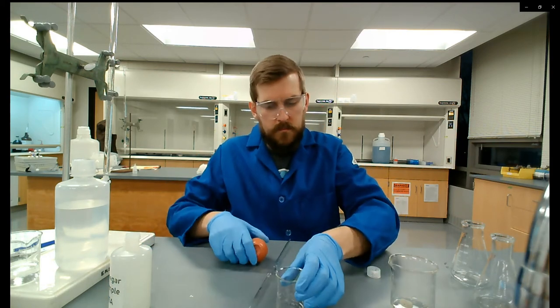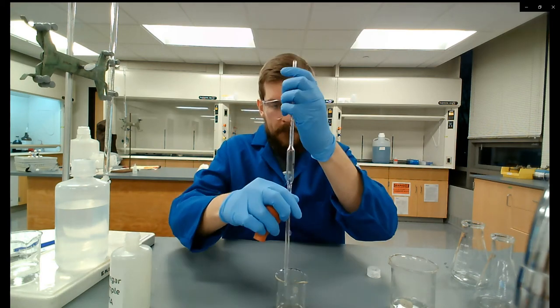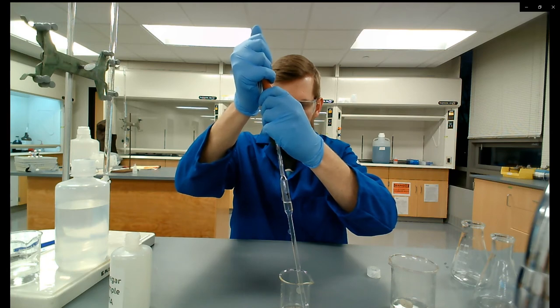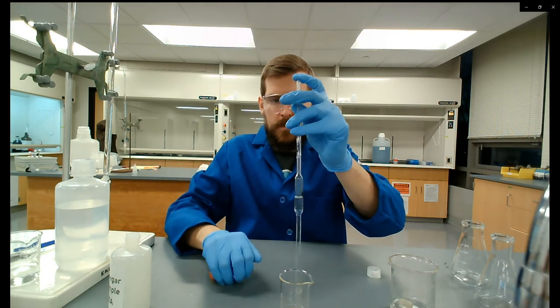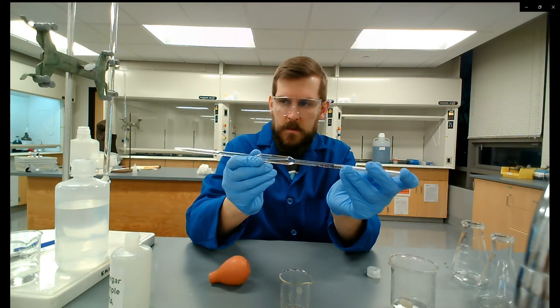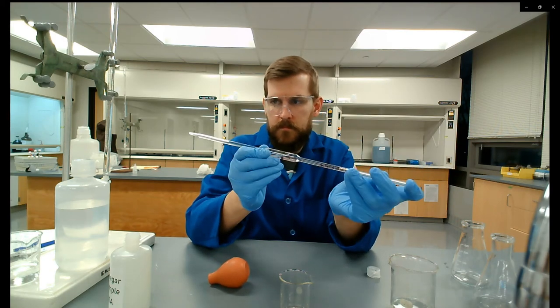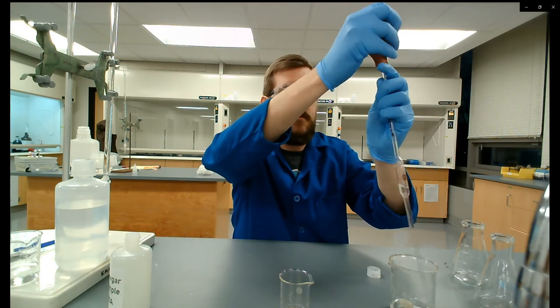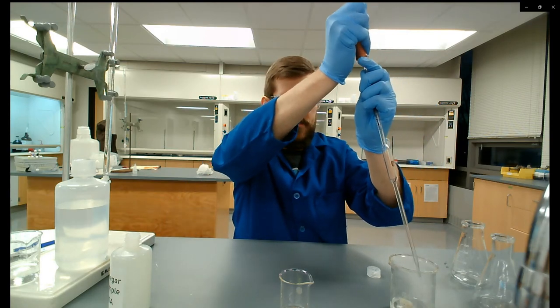I'm pouring out a small amount of vinegar sample into a separate container and pulling some into the pipette to condition it. We want to rinse and coat the walls of the pipette with the solution we're going to use, so we're not diluting or contaminating the vinegar sample we're actually trying to analyze. I'm blowing the pipette out here.